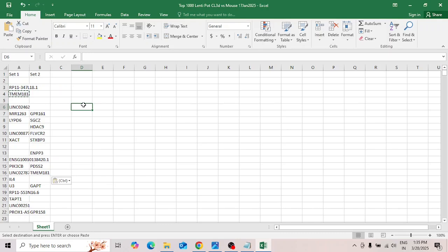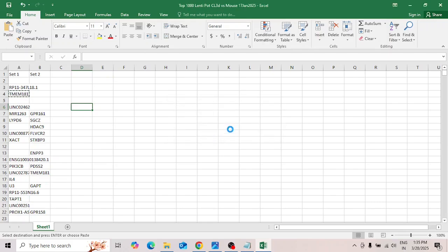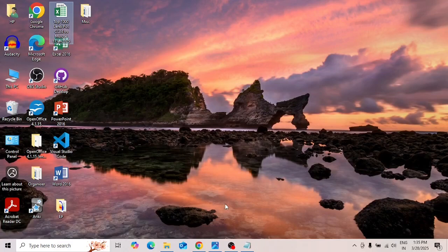That's the only requirement, really. The spreadsheet format to use can be Excel, but you can also use OpenOffice spreadsheet as well. That will work. So now I'll show you how to install the program.